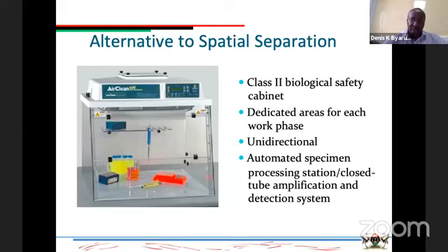potential contamination. Particularly in cases where you have serious and widespread pandemics like COVID, you may be required to have these kinds of stations where you can manage within the resources and infrastructure available to you, but keeping at the back of your mind that you are able to eliminate all kinds of contamination by your physical practices, while also utilizing the resources and platforms that can avoid any potential compromise of your materials.